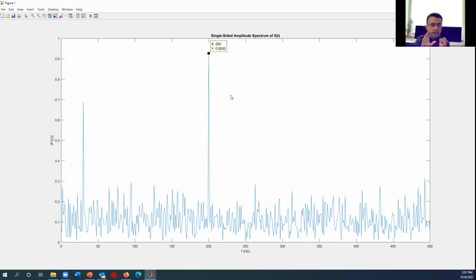Just like that, we get its spectrum from the interference phenomena coming from the wave acting on the material. When you take the Fourier transform of this wave phenomenon, infrared light acting on the material, you can go back and analyze in the wave number domain which bond I am looking at.